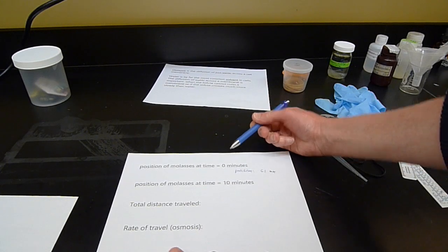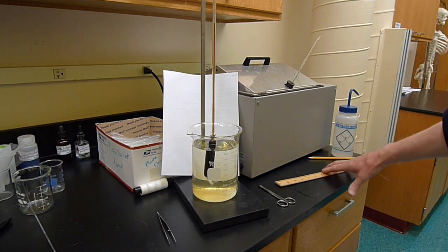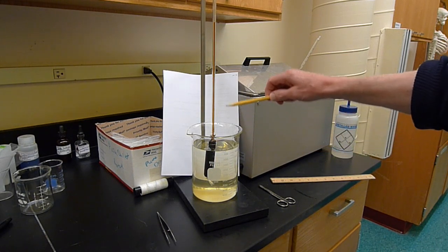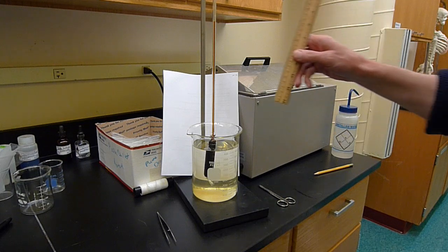Come back in 10 minutes, we'll measure it again, see how far it's gone. So we're back after 10 minutes. I'm going to measure the position of the molasses again, but notice how much it's migrated up this tube. This sucker's really screaming away here. So I think I got a long enough ruler.